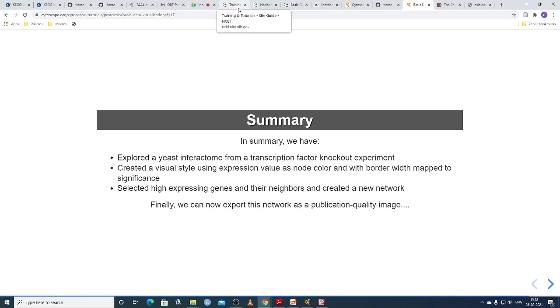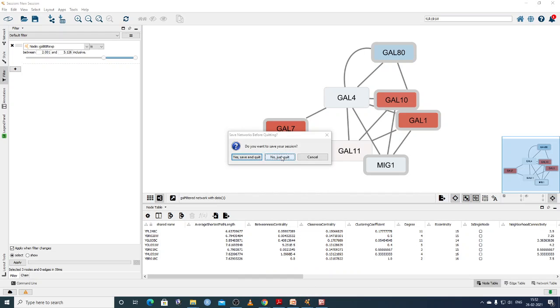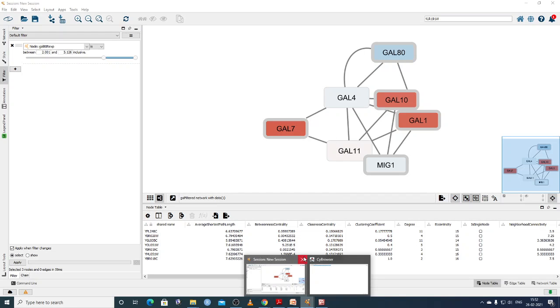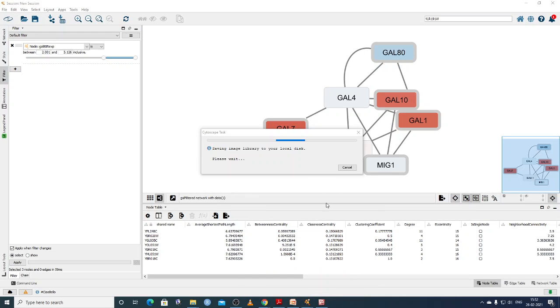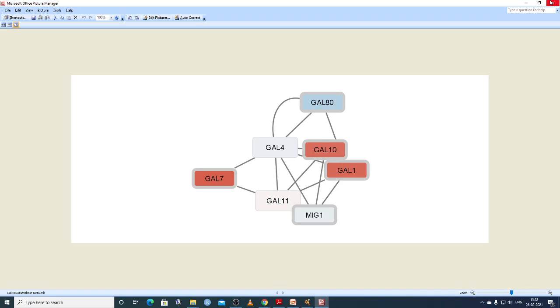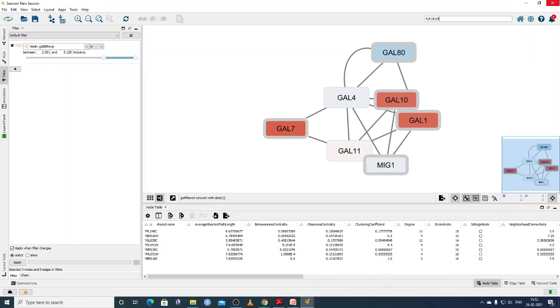We want to cover. So let us see. So let us close unrelated window. So this is not related. So the Cytoscape window here. So basically students can analyze the data by themselves and they can try it at their home computer. So not a very big thing.